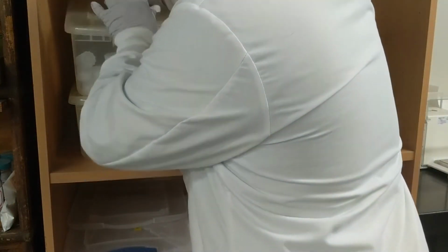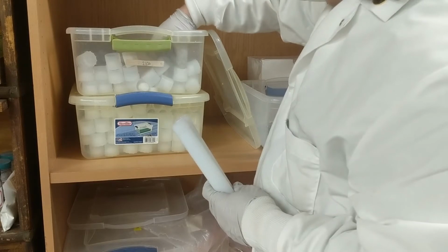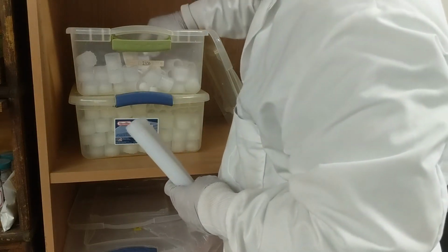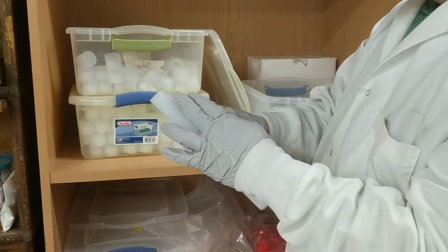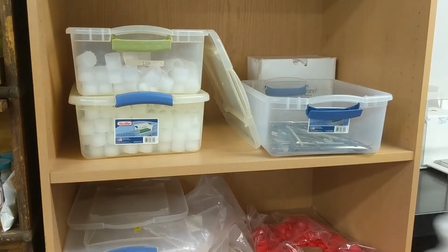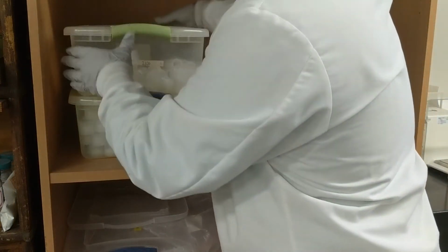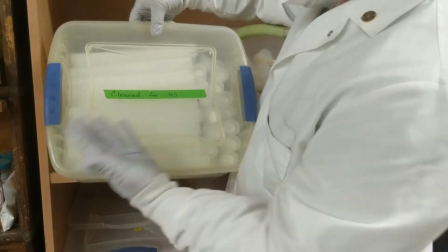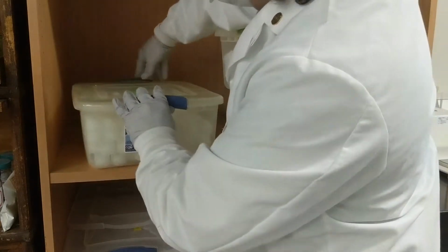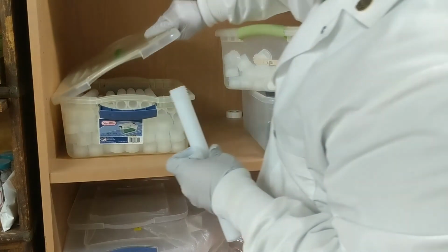We need to use our Teflon microwave vessels for this. We actually have 2 different sets of microwave vessels. The set in the top bin are our regular clean set, and that's the ones that we use for atomic absorption and ICP OES. You can see you've got the caps and the stoppers. And then in the bottom bin, there is the extra clean ones, and we'll go over how to clean those in this video briefly, but basically those have been cleaned and then sent through the microwave another time. So those are extra clean for our ICP MS samples. Once again, using one of these tubes and a cap and a stopper.